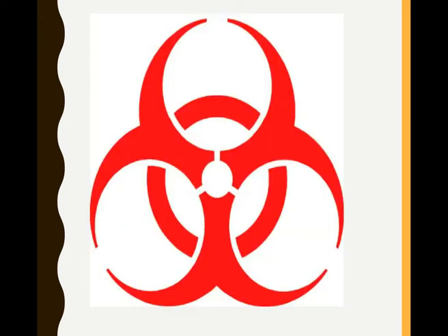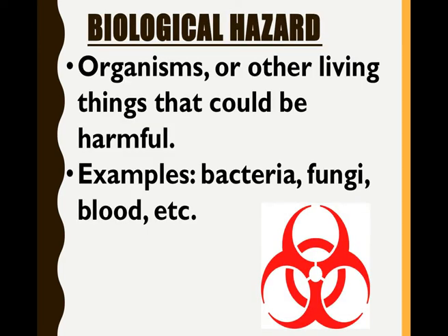So this first one, I'd like you to take a look at it, and mark down on your paper quickly what you think this lab safety symbol means. What this actually means is this is a biohazard. So when you see this symbol, it could be dangerous or cause harm to living organisms, including you. So this could be some type of bacteria, it could be some type of fungus, something that would actually do harm to another living thing.